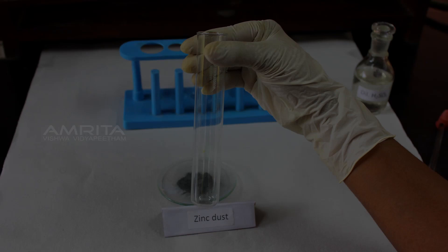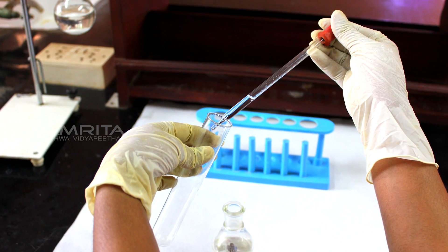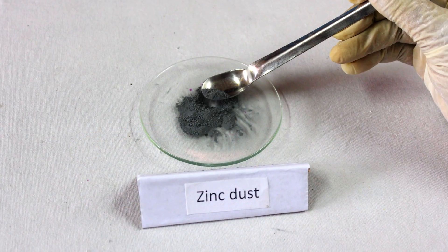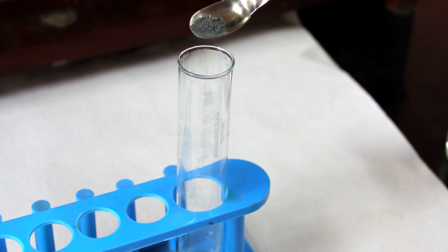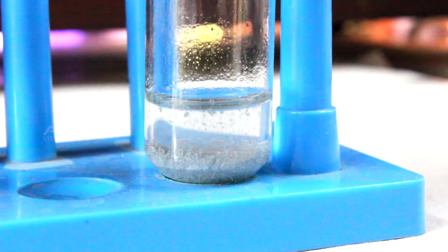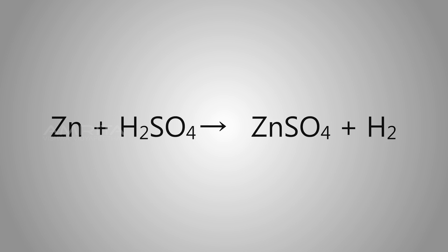Procedure: Take a boiling tube and add a few drops of dilute sulphuric acid using a dropper and place it in a test tube rack. Then add some zinc dust into the boiling tube using a spatula. In this reaction, zinc reacts with dilute sulphuric acid to form an aqueous solution of zinc sulphate and hydrogen gas evolves. That is, Zn + H2SO4 → ZnSO4 + H2.